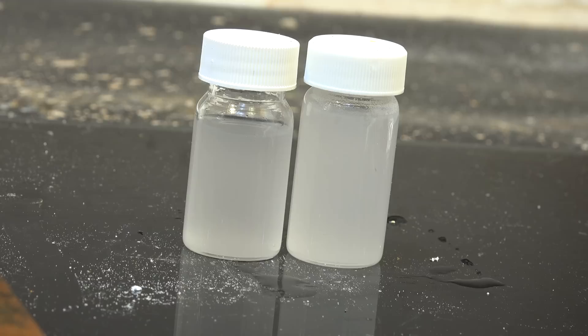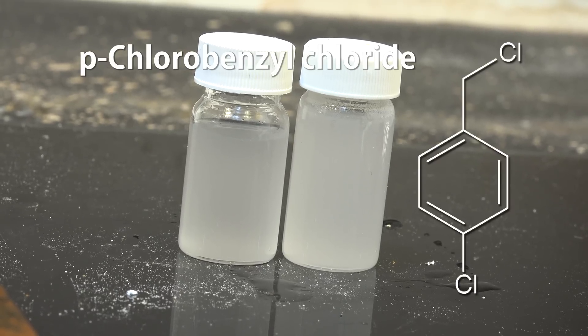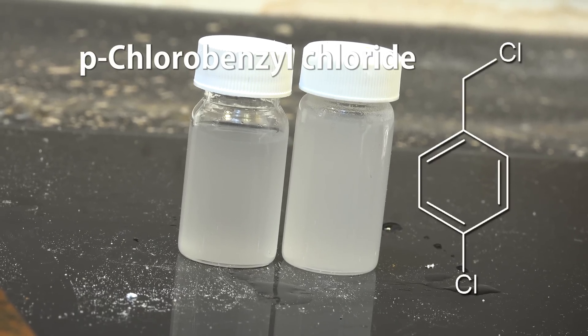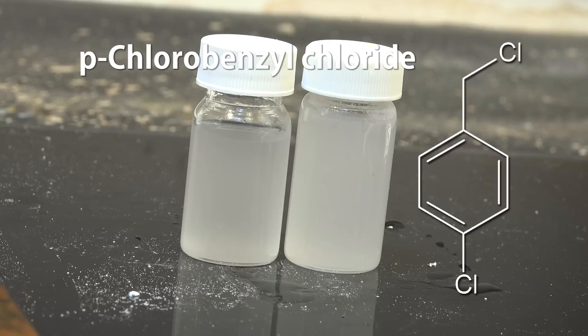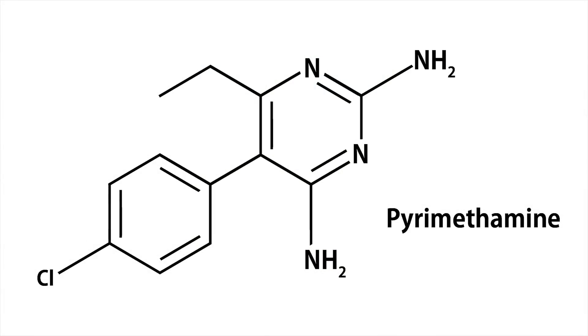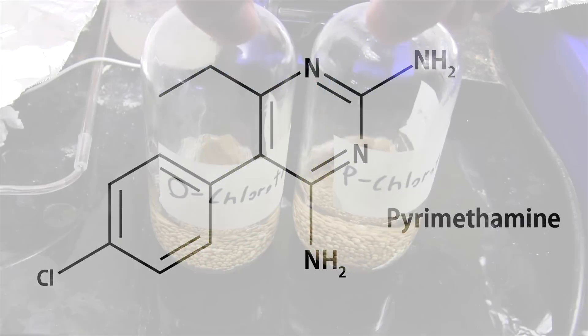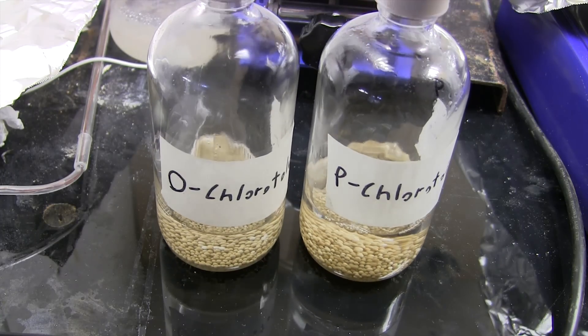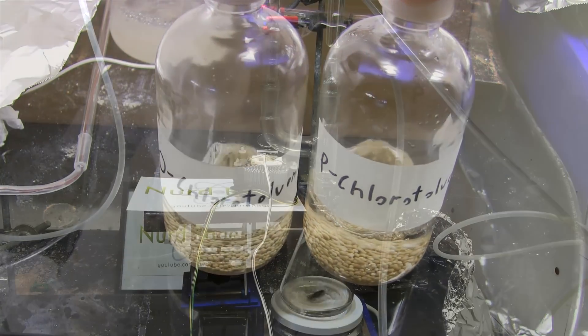Greetings fellow nerds. In this video we're going to make p-chlorobenzyl chloride, also known as 4-chlorobenzyl chloride. This is the next step in making the antiprotozoidal drug pyrimethamine after we made the p-chlorotoluene in a previous video. So let's get started.